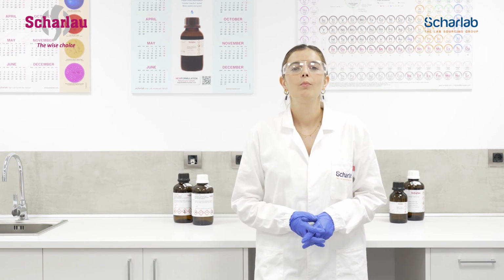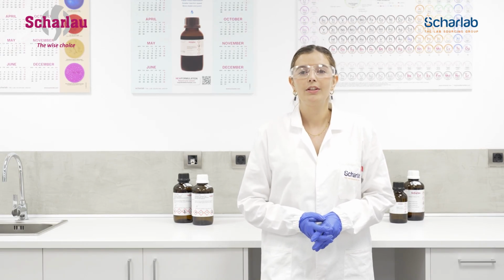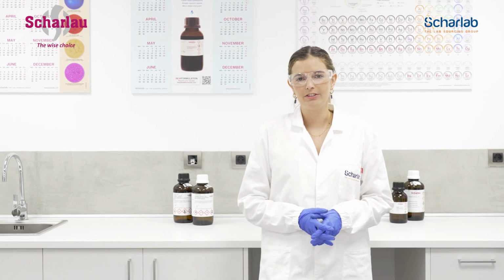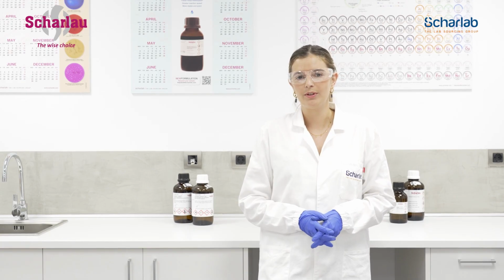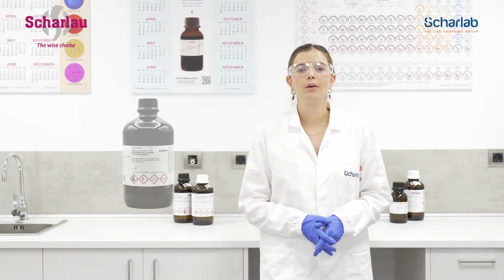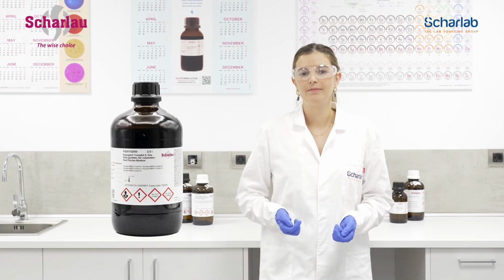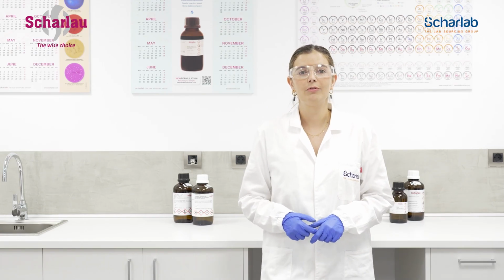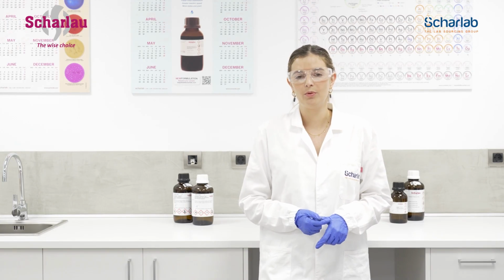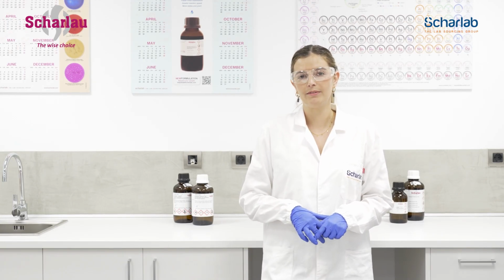You might be wondering, what is the difference between single component and two component reagents? Well, let's start with the single component titration. The titrant, which contains iodine, is added to the sample using a burette, reacting with the water present. This allows us to calculate the water content precisely. In this method, all the components necessary for the reaction are in a single reagent, the titrant. This allows the flexibility to use different solvents, such as dry methanol, which is more economical and dissolves the sample well, or our methanol fast, which reaches the titration endpoint more quickly.